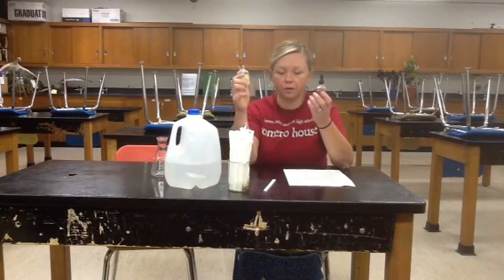All right, so for this lab, you're going to need distilled water, 1 straw, phenolphthalein, which is marked with a red P, sodium hydroxide, which is marked with a yellow sticker, NaOH, 2 flasks, and a timer. You will have to share your sodium hydroxide and the phenolphthalein between 2 different groups, because I just don't have enough to share.